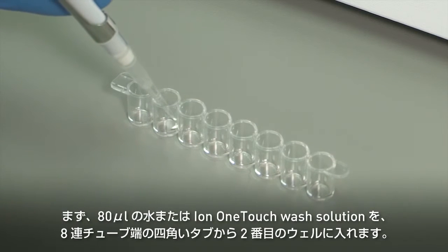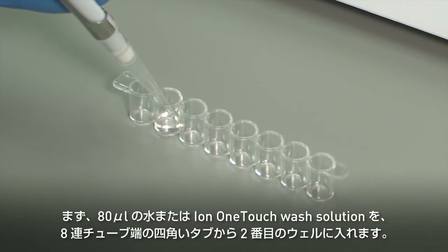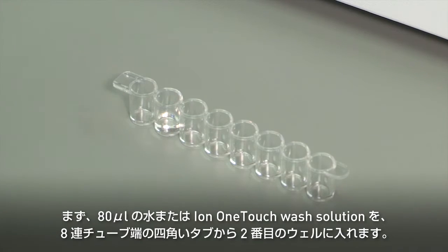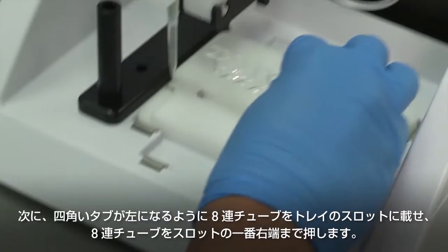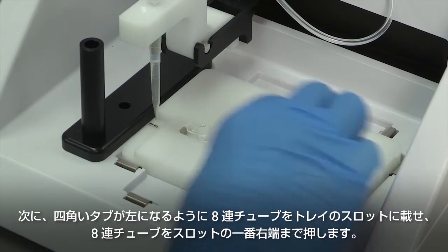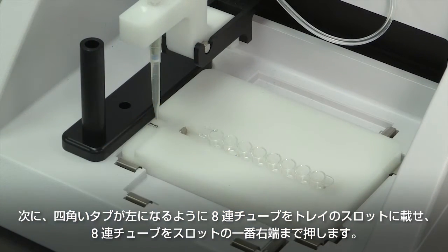Load 80 microliters of water, or Ion OneTouch wash solution, into the second well — well 2 — from the square-tabbed end of the strip. Next, load the 8-well strip into the slot of the tray so that the square-tabbed end is to the left and the strip is pushed all the way to the right until it touches the end of the slot.